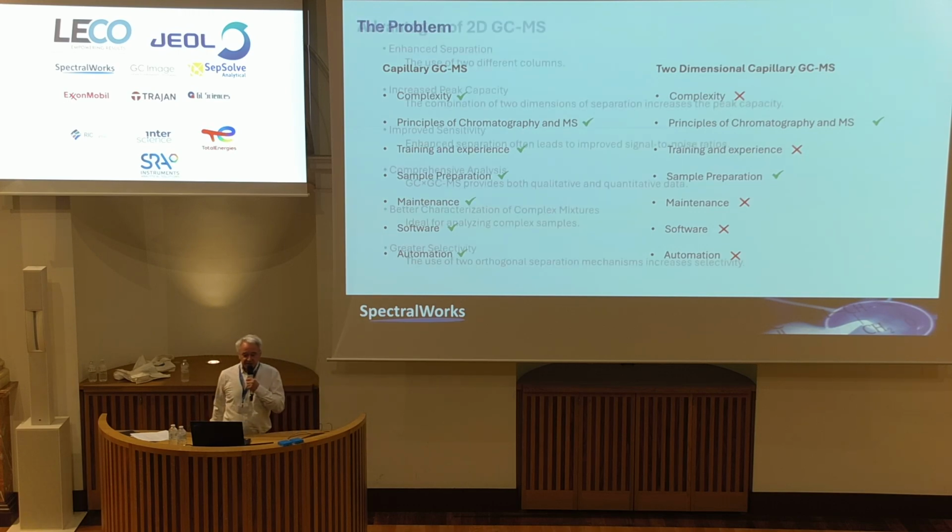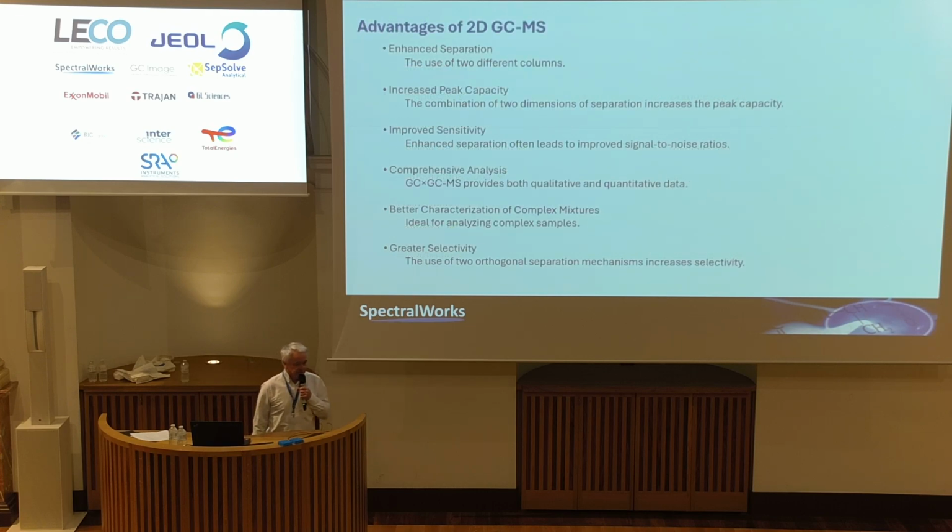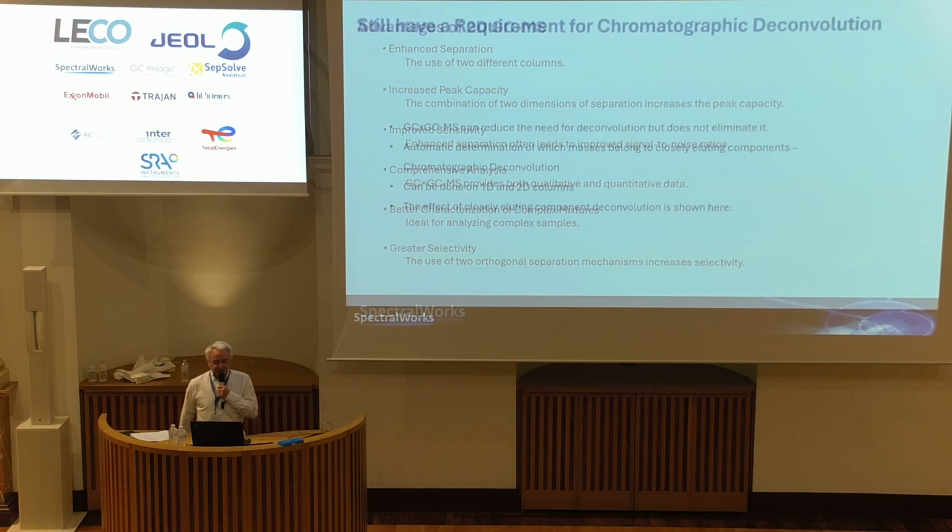I'm going to really skip through the advantages of 2D GCMS. I'm sure everybody's been either at the workshops or knows it very quickly: enhanced separation, peak capacity, sensitivity, comprehensive analysis, characterization, all of this sort of stuff. But I realize that we're short of time this morning as well.